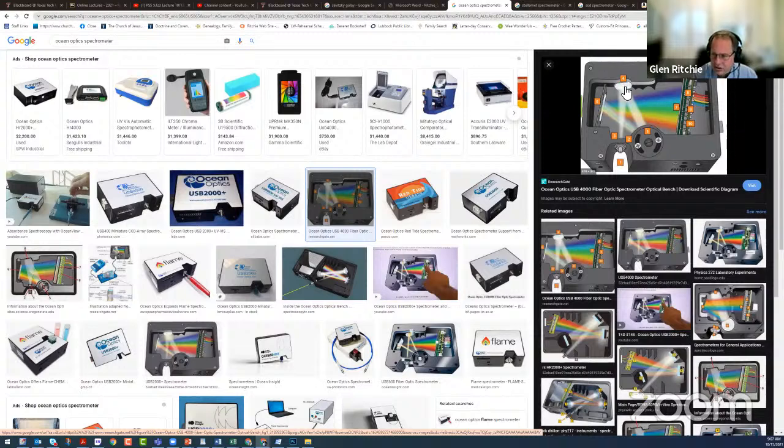Now, one of the challenges you run into is that you don't have enough space right here to get enough dispersion to really disperse the light out onto all of your sensors to be able to pick up the quantity of light by wavelength. So it actually passes this light through 3 mirrors. There's one here, and one here.